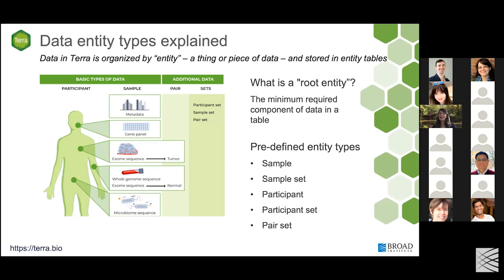And today you'll see examples of this, and also see how when you're running a workflow in Terra, you'll need to specify the root entity. So that's just a way of saying what data table do you want to use that contains that minimum amount of data that you want to analyze. So I just wanted to use this today to introduce you to this idea of entity, because we're going to be saying that word a lot.